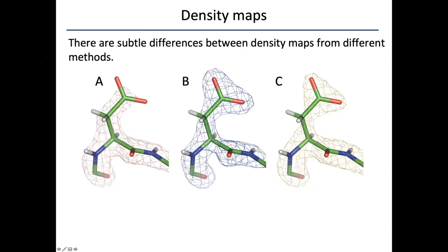So maybe while you think about it, I can talk a bit more about how I generated these maps. These are model calculated maps. These are not experiment, so no data were used. These are purely determined from a model. And so I used B factors of 20 for each atom. I used a negative charge on these 2 oxygen atoms at the carboxylate group of the aspartic acid side chain, and the unit cell was P1. I used a buffer around 5 angstrom from each atom.